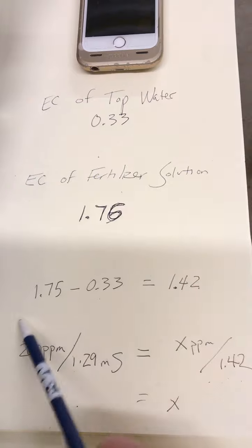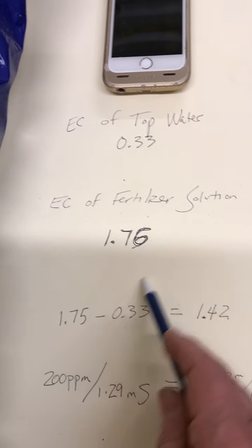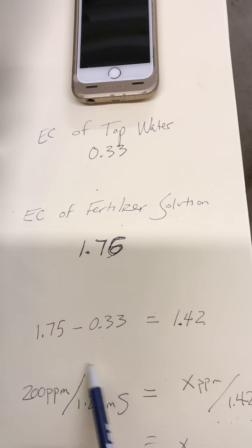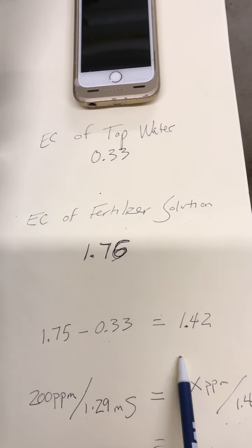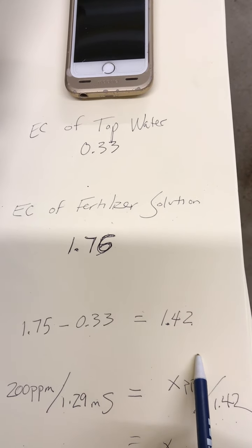Now what we're going to do is take our fertilizer solution, and I changed it there a little, the number was bouncing around, so don't fret that they're a little different. 1.75 minus 0.33, which is our tap water, gives us 1.42. And now we have something we can work with.